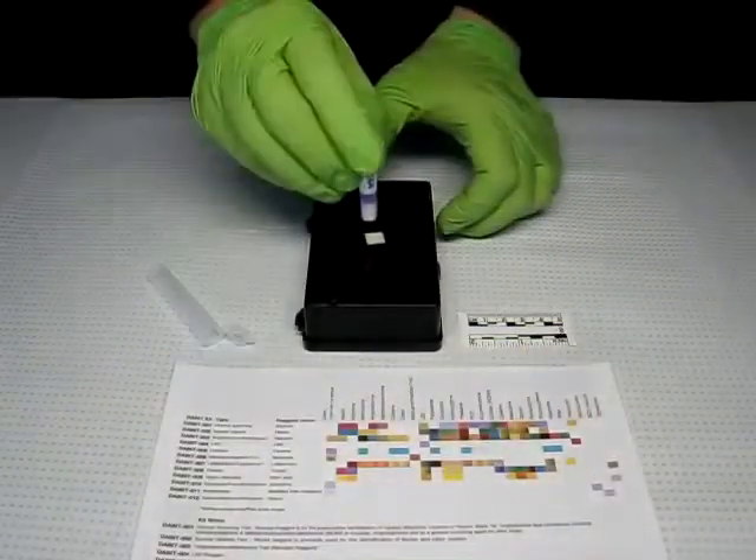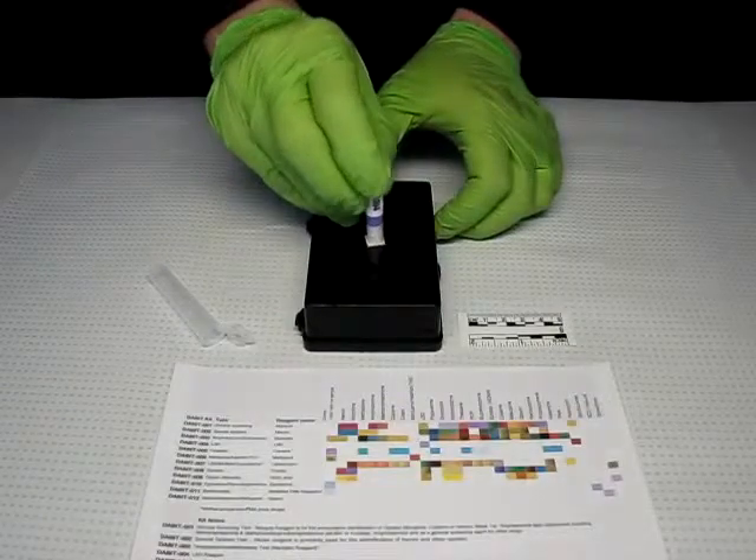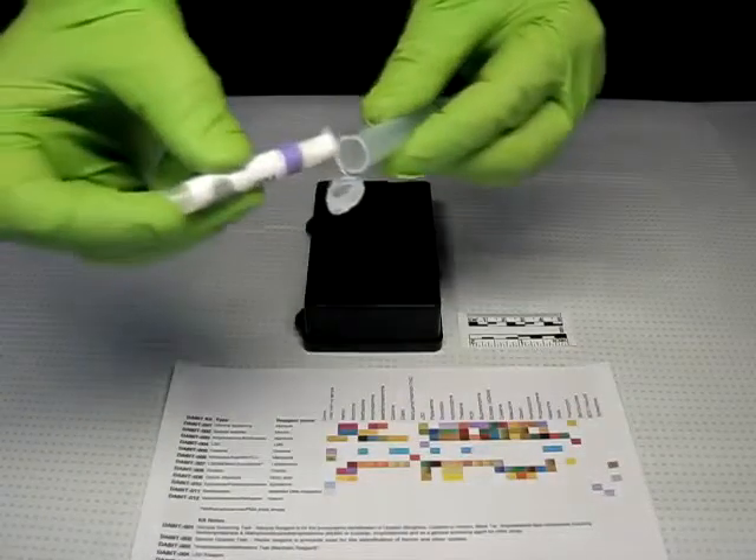In this case, a small piece of paper. Replace the sampler into the clear outer tube tip first. Close the cap.